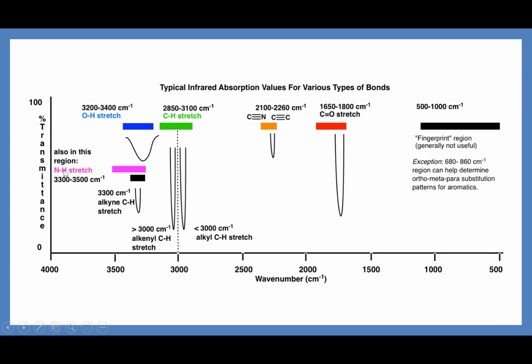We also start to see amine groups here: primary, secondary and tertiary amines. Again, they will be referred to in your table, so you can take your time walking through those, but we'll see those appearing around 3,300 to 3,500. We also start to see lots of carbons and hydrogens in this region. If we're looking at anything like alkanes, just long chains of carbons and hydrogens, we'll typically just see a peak up around the 3,000 mark.